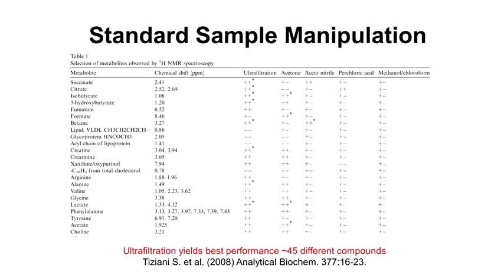A paper was published in 2008 looking at these protocols and comparing them. And the answer was pretty clear from this study: ultrafiltration is your best method. That's the method we've been using ever since, and many other groups use. And that's the method that's configured for Bayesil and the Bayesil kit that I talked about.